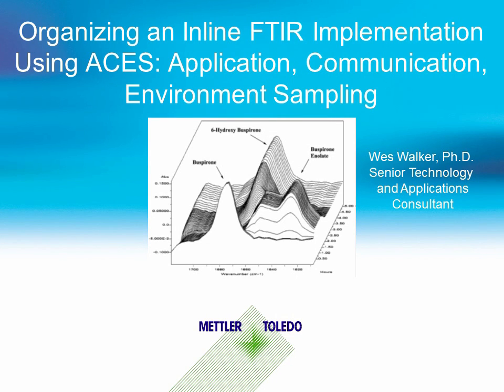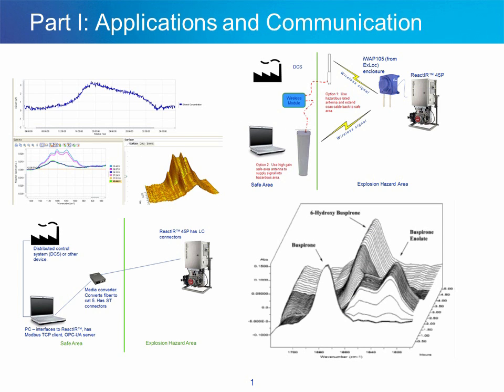I'm Wes Walker. Our topic is organizing an inline FTIR implementation using ACEs: Application, Communication, Environment, and Sampling. Today we will focus on Part 1, Applications and Communication.